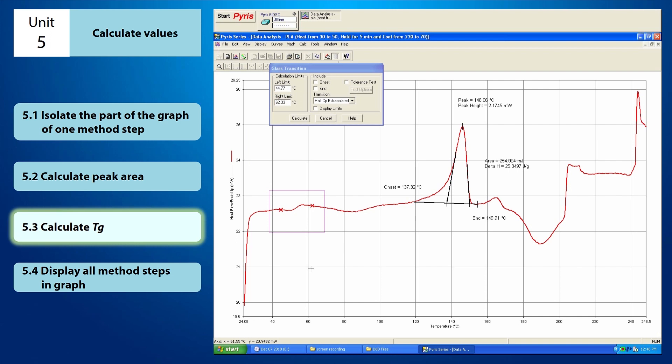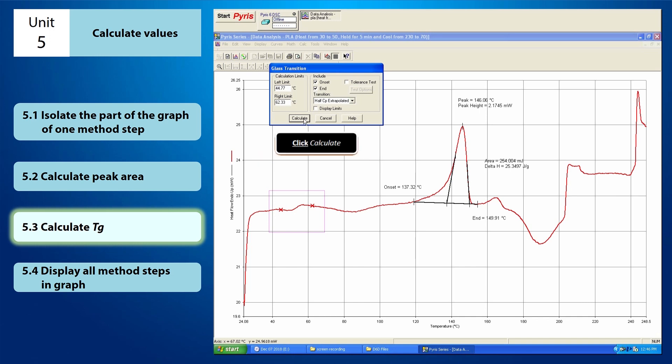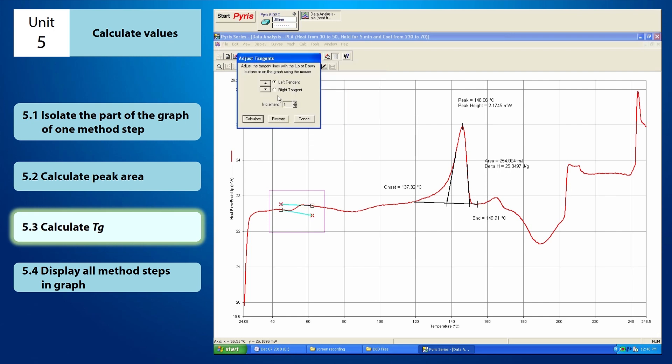Once you have captured the TG, you need to check the Onset and End boxes. After that, click Calculate after confirming all the data are set correctly. Once you click Calculate, the Adjust Tangent window will appear.